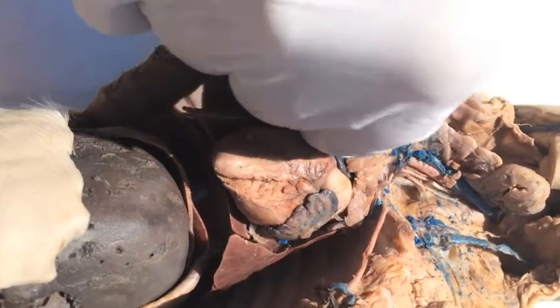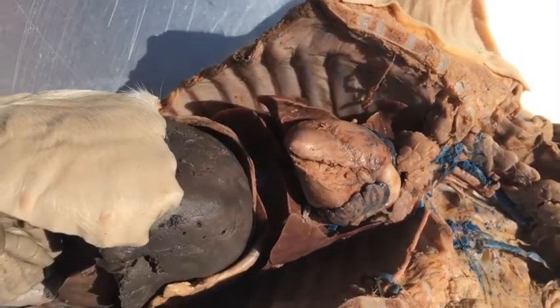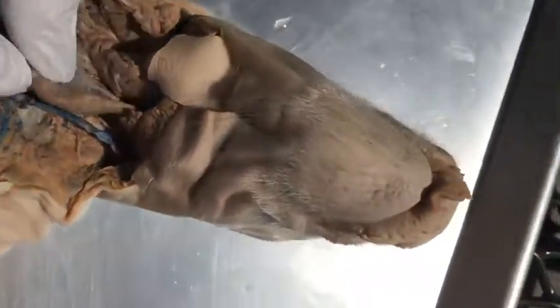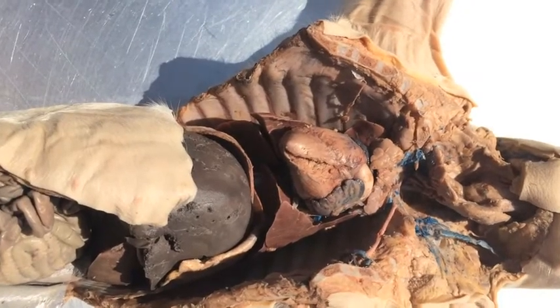The bronchi are up here, and those are the main passageways that separate into the lungs, and it carries air from the trachea to the lungs and backwards. The trachea is right there, and it's the windpipe, which carries air to the lungs and back. The heart is right here, and that's responsible for pumping blood throughout the body and to and from the lungs.